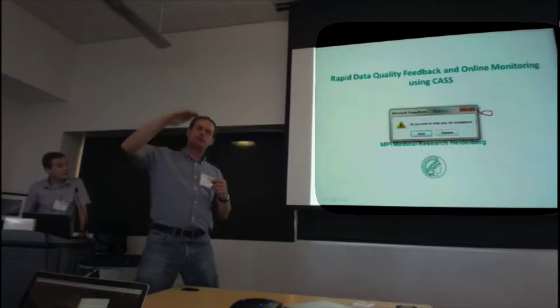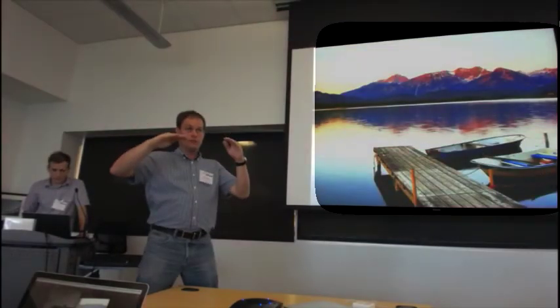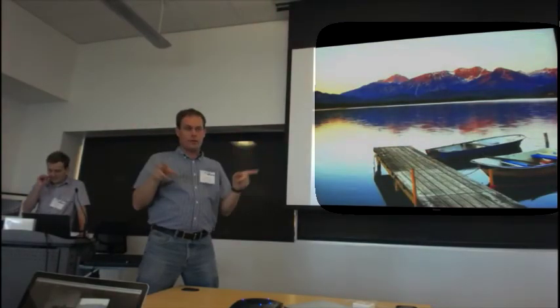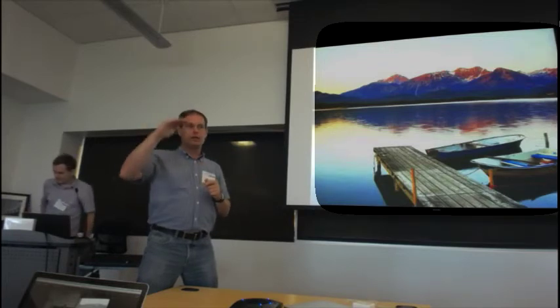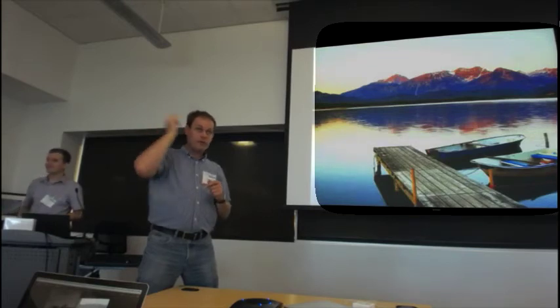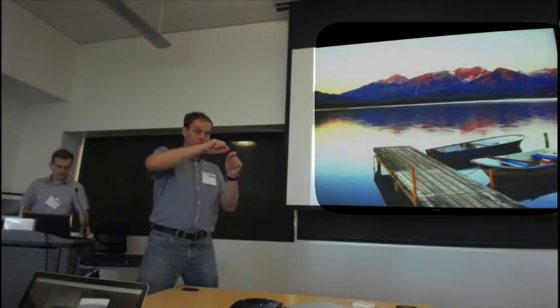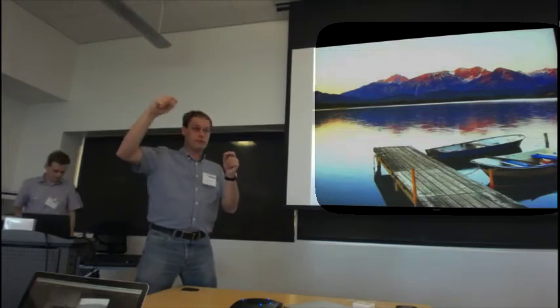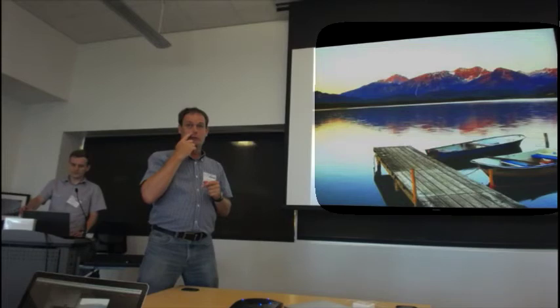That should have been just a pedestal moving up and down, so we tried to estimate that pedestal and shift it around. We tried to estimate where the hot pixels and bad pixels are in the data, and shift that common mode offset around. In previous versions of the CSPAD you had to estimate it. Now, from version 1.6 of the CSPAD, there are unbonded pixels that you can use to provide a slightly better estimate, so that can be taken into account.